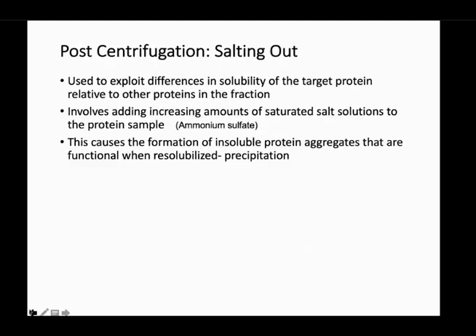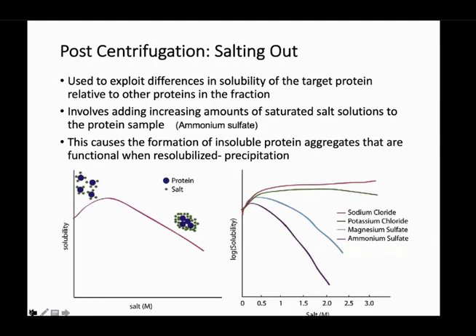Okay. I'm gonna go back to the specific activity in a moment. As I mentioned, there is no one single method when you're studying proteins at all. This is just to start. For example, in my case, I do cancer. So one of the things after I treat my cells is that I lyse the cells. I break apart the cells, and then I look for specific proteins. I extract the protein from the cells, and this is the first step.